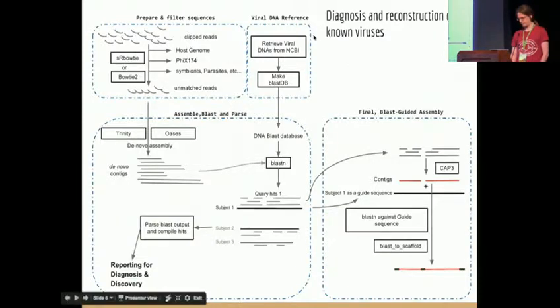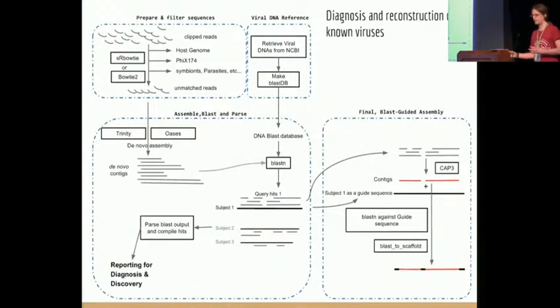We can also take the assembled contigs and the hits, go back and fill that in with sequences from BLAST so that you get this contig.